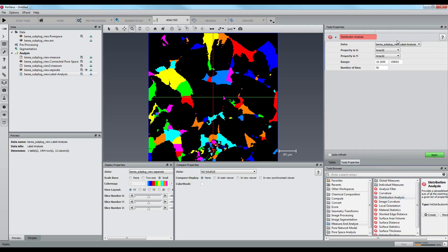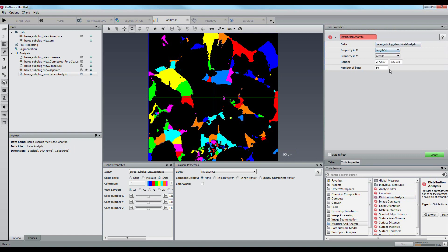Finally, the pore size distribution is analyzed with the distribution analysis module, allowing a cumulative size distribution against the length of each pore.